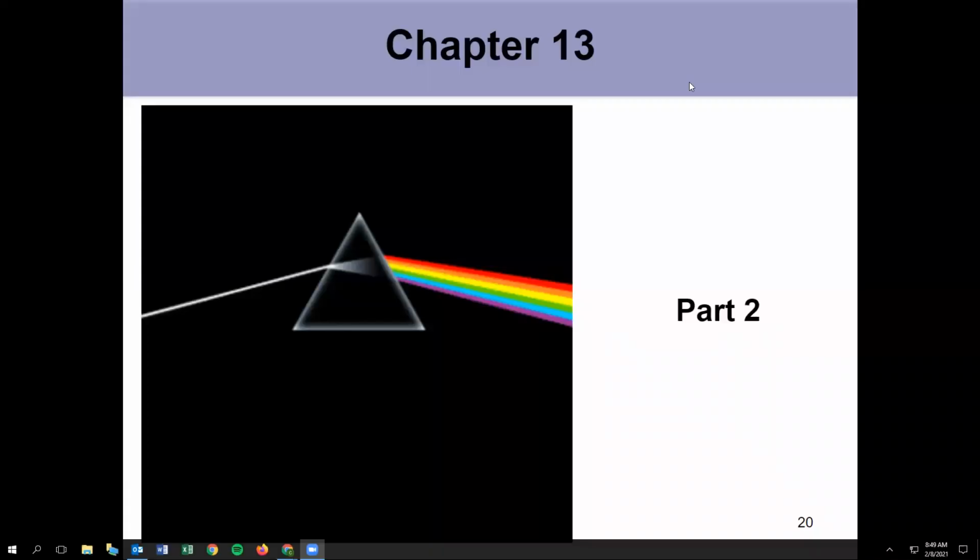Alrighty, in part 2 of chapter 13, we're going to talk about isotopes and explain what that heavy peak showing up in mass spec was. We will finish mass spec overall. There are a lot of examples from what we're going to cover in this part in your textbook if you want extra practice.